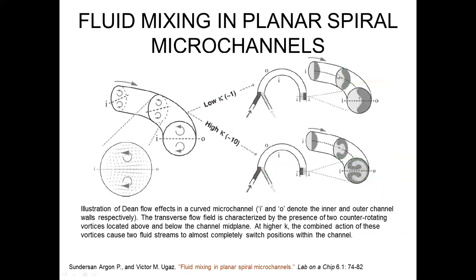And again, these bends, we can see in this picture in the top right-hand side, what they do is they fold the liquid over on itself, causing mixing. So this is known as the Dean effect. And this is another tool of the dozens of analyses that we have to do to look at microfluidics. But this is certainly an important dissection of what happens within a microfluidic device.